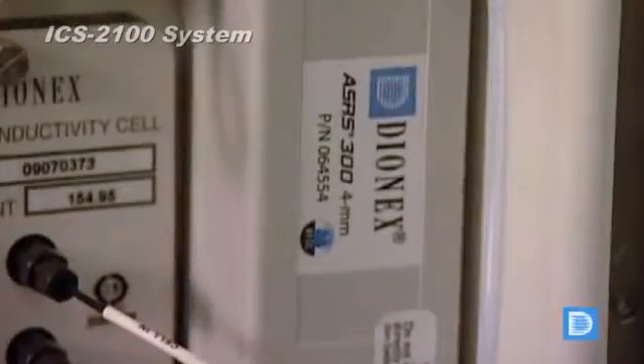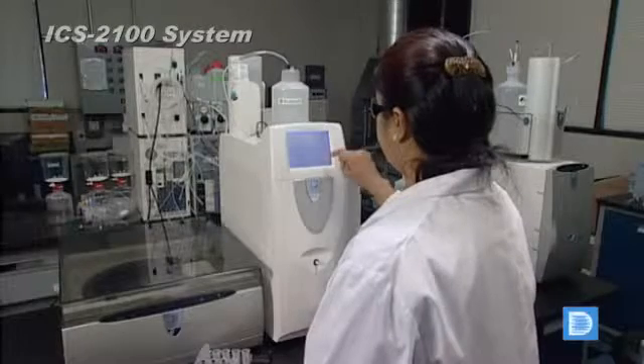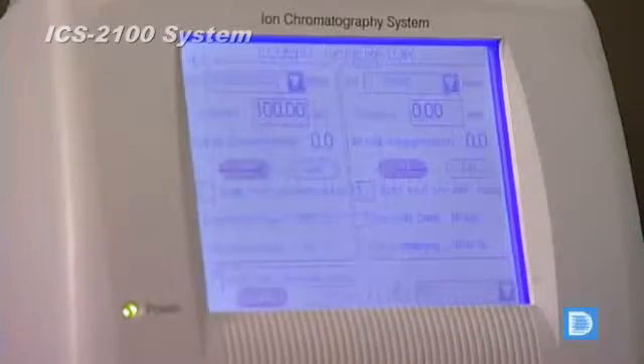No additional pumps or valves are required for operation. The onboard LCD controller makes instrument configuration and control easy. Type in the current required on the panel and the unit does the rest.